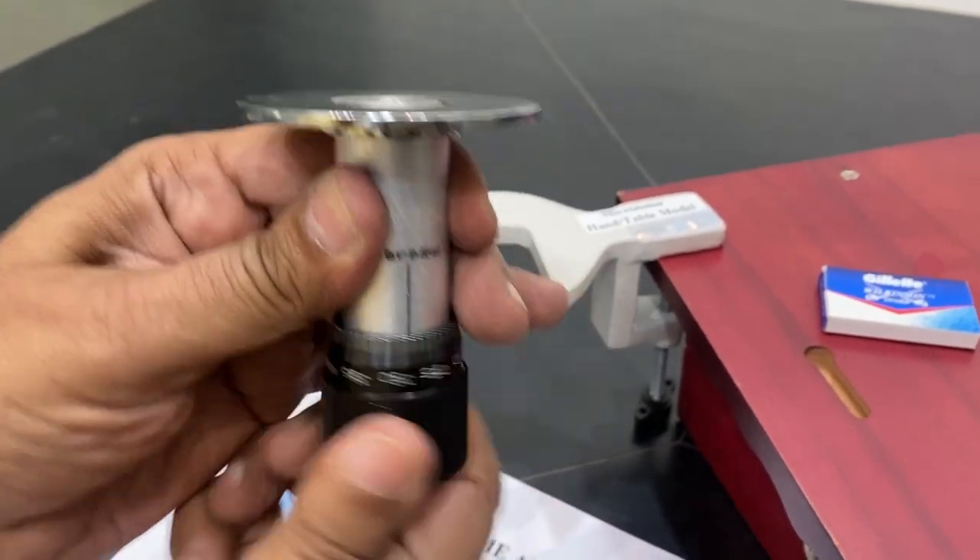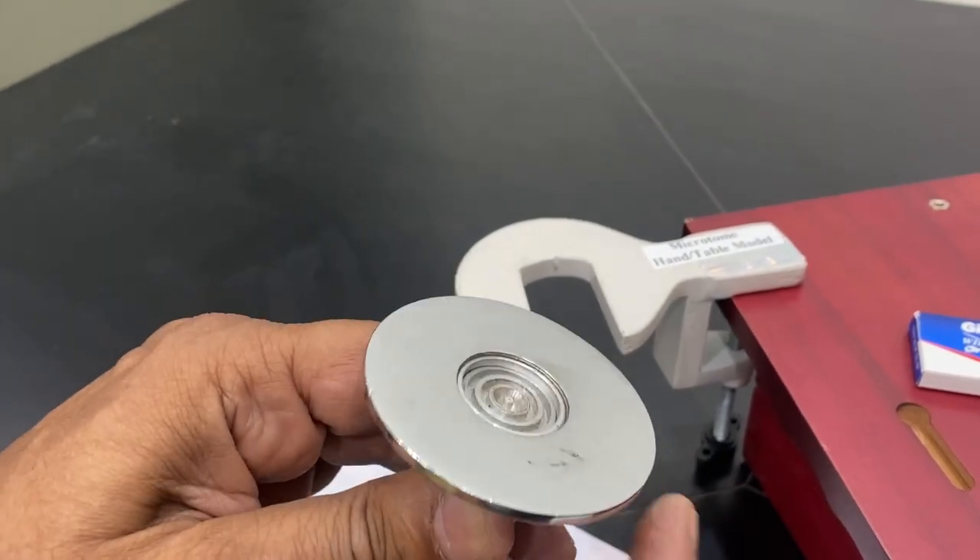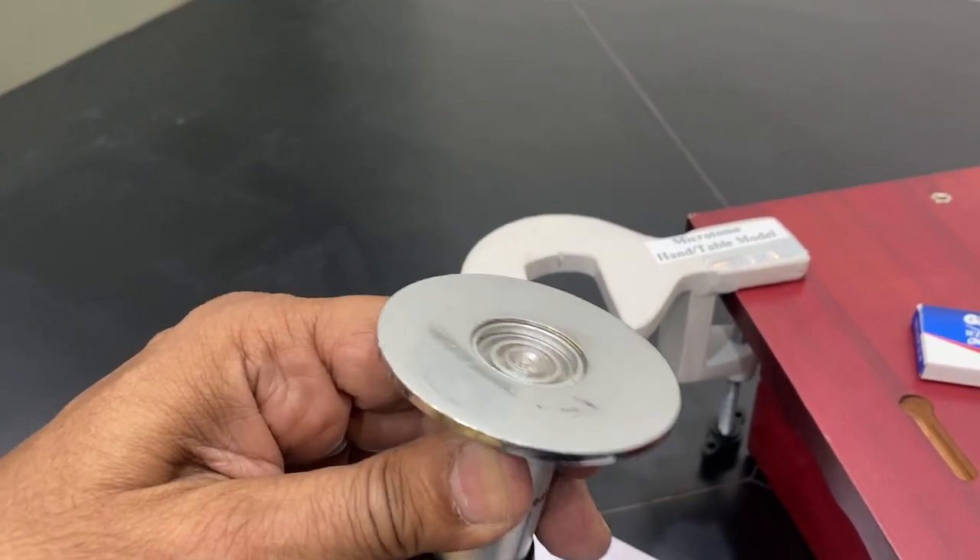See this — I am now moving it, so the block is coming down. It has gone inside. Now slowly I can move it up.